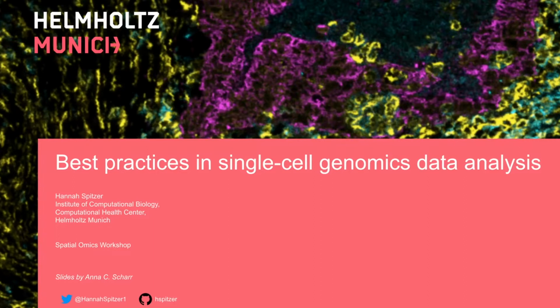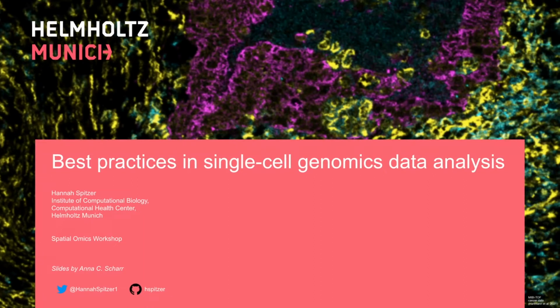Wonderful. Like Christophe already said, my name is Hanna Spitzer. I'm from the Computational Health Center in Helmholtz, Munich, and I work in Fabian Theis's group. We've been developing with a large community these Python tools for single cell analysis. You may have heard of Scanpy, and recently Giovanni Palla and I were leading the development of SquidPy, which is this Scanpy extension for spatial omics analysis.